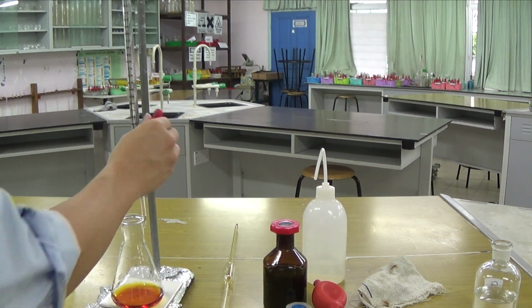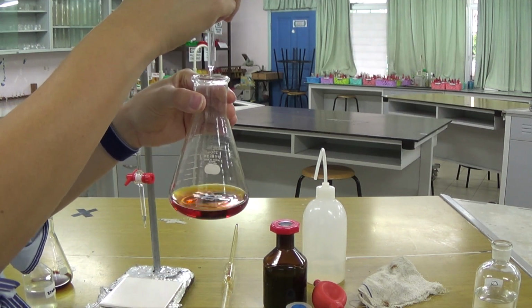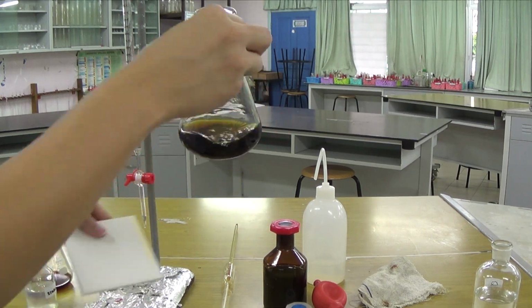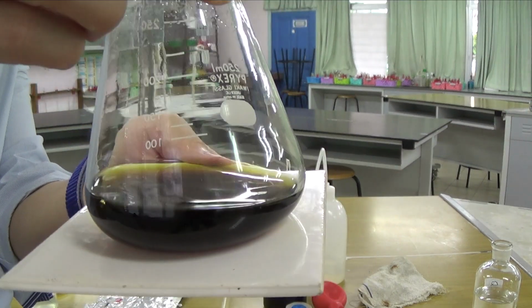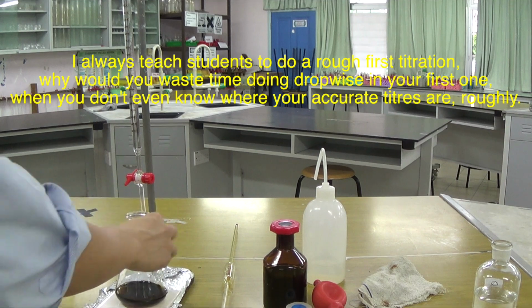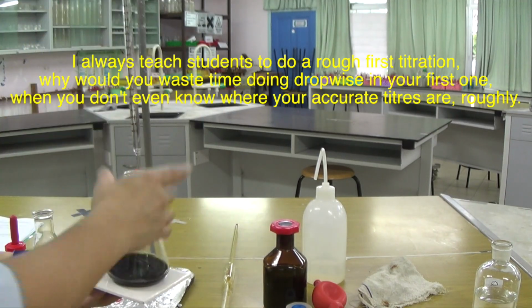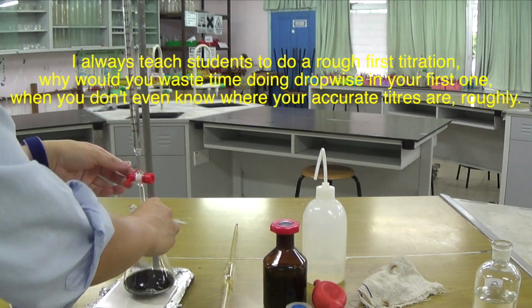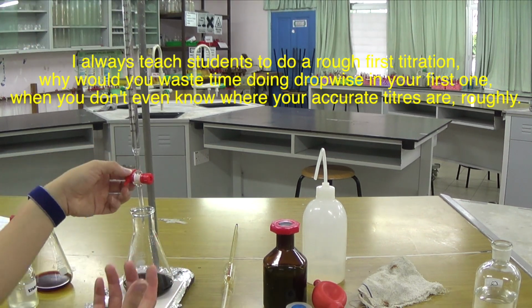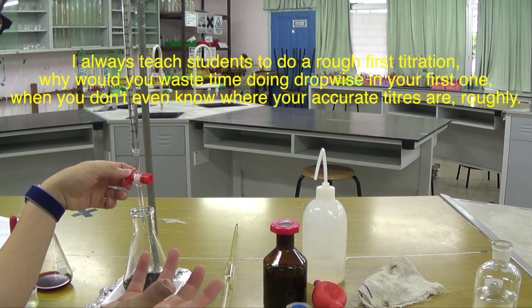It depends on you really, but the moment I add in the starch, you should hopefully see it get blue-black. You don't need to add a lot of starch, because just a little bit of starch will give you the blue-black coloration. It's a dark coloration. Of course, the more you add, the darker it becomes. If I add just a bit more starch, as you know, indicators do not get involved in the reaction. They simply give you a color change. So even though this is already brown, it gets a bit difficult to tell the end point without the use of the starch indicator. We should expect it to go colorless, because when all the iodine is gone, starch with no iodine would just be colorless.